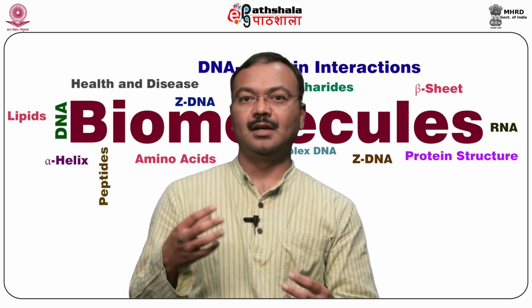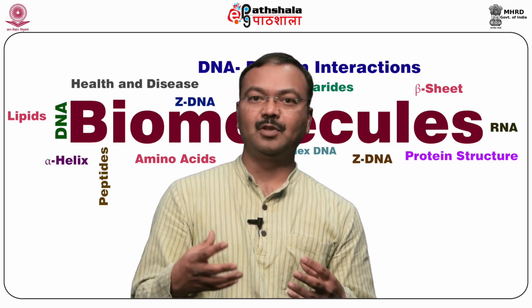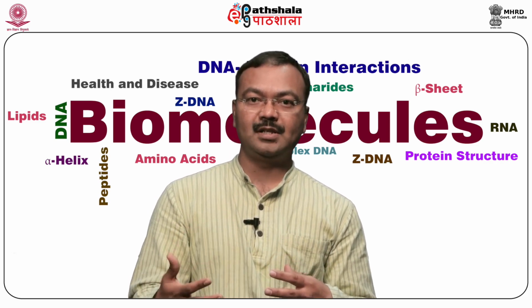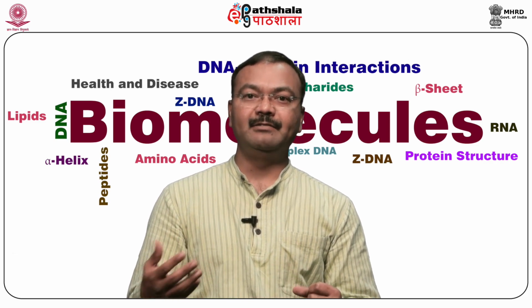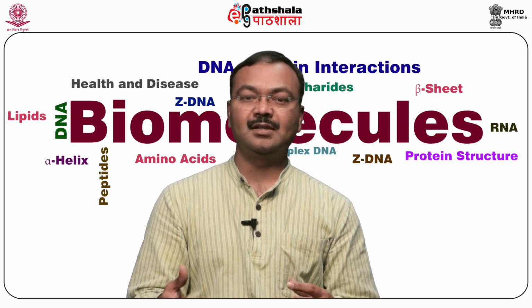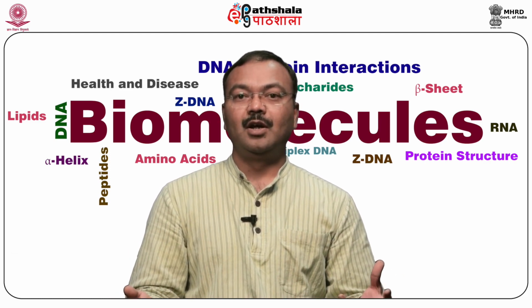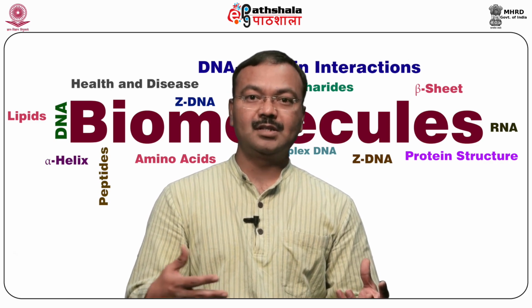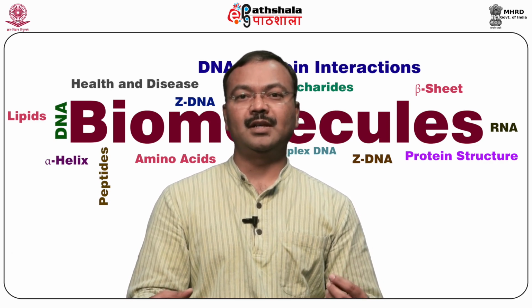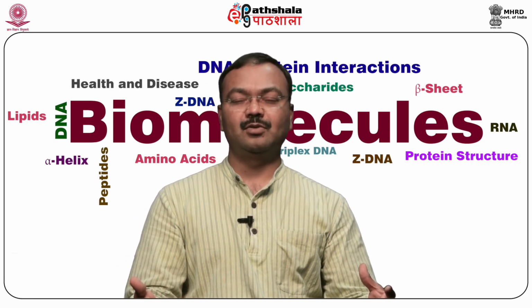If the protein has a cofactor binding site or a ligand binding site, it's better to add it along with the protein, otherwise the protein becomes more dynamic, and a dynamic protein is difficult to crystallize. You can add additives, and it's also better to crystallize proteins at lower temperatures, but it's not necessary. Many proteins crystallized in my lab are at 16 degrees centigrade. Gravity influences protein crystallization. It is experimentally proven that proteins crystallized in space are of better quality. And of course pH influences the solubility of the protein.